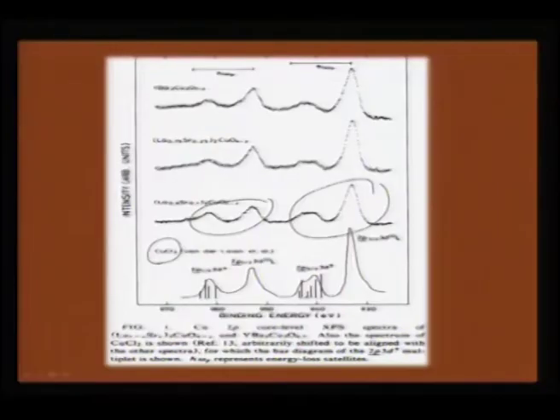The split in each peak clearly shows that copper is not remaining totally as copper 2+, but a part of copper 2+ is oxidized to copper 3+, and that is happening in order to bring charge neutrality into this lattice. Therefore, this valence state of copper 2+ and copper 3+ has really helped the community to ascertain the conduction mechanism which drives these superconducting oxides to show absolute zero resistance.